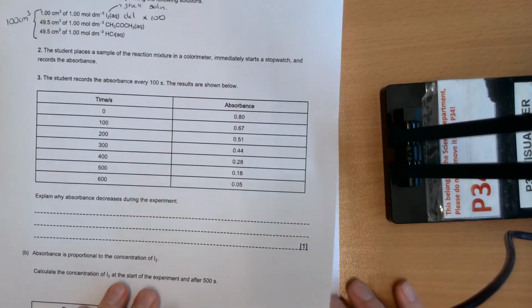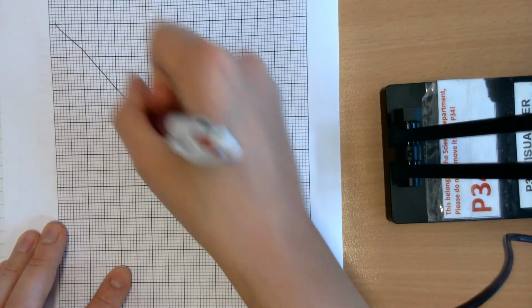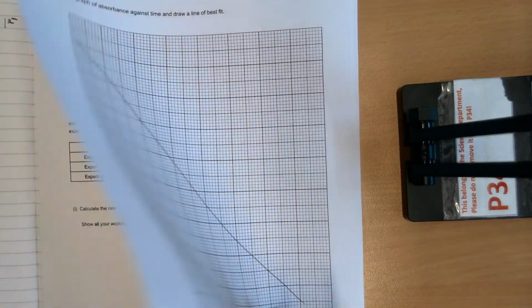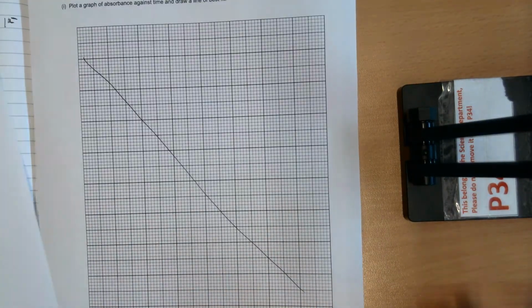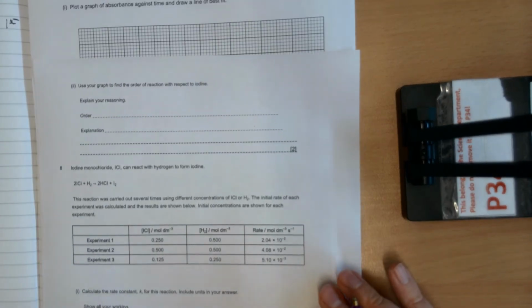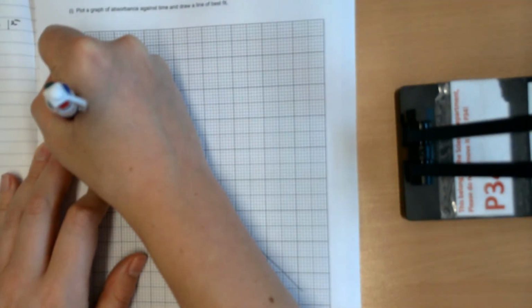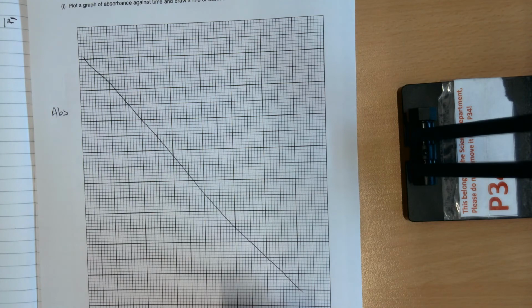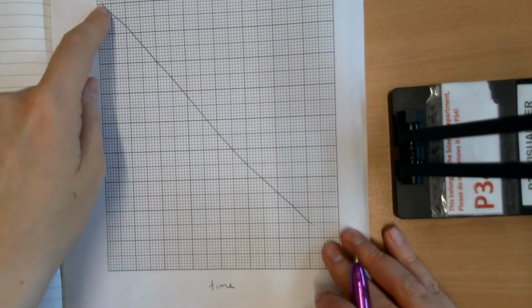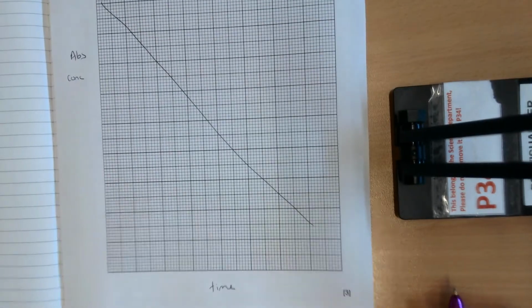And what you should see is you end up with, I think, a straight line graph that looks something like that, okay? And then the last question asks you to use your graph to find the order of the reaction with respect to iodine and to explain your reasoning, okay? So on this graph here, I've got absorbance and I've got time. And we know that the absorbance is directly proportional to our concentration. So as the absorbance is decreasing, so too is our concentration decreasing.